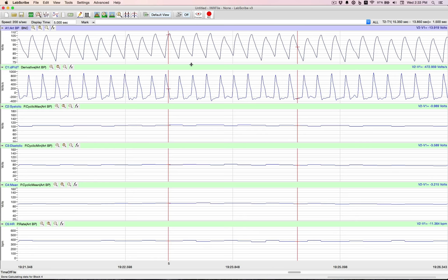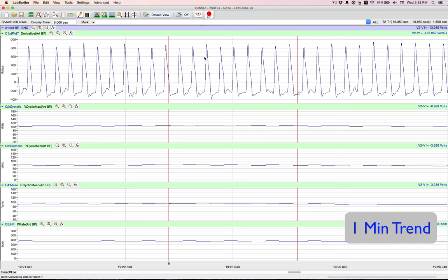Another scenario might be we want to do a 1 minute trend. Now to do that, we can move some channels out of the way.